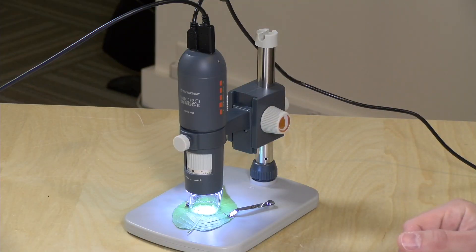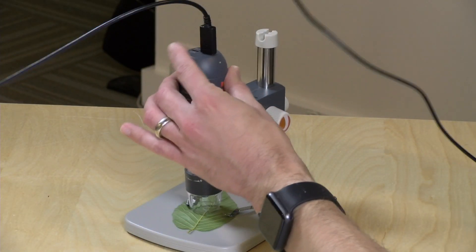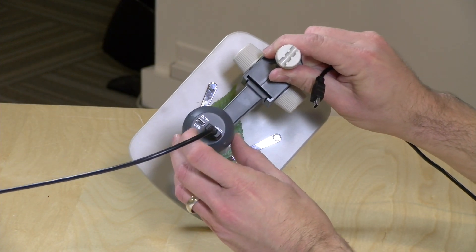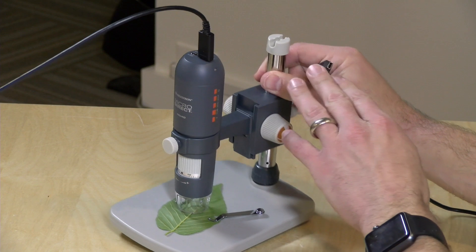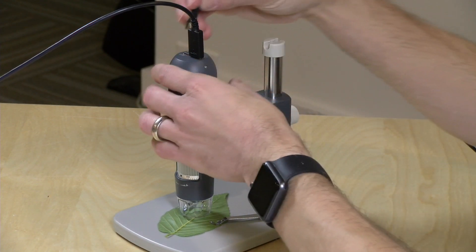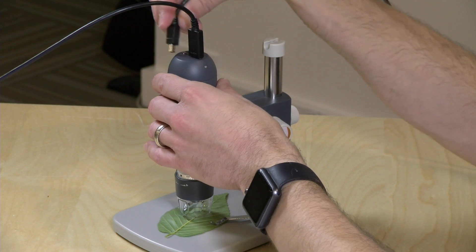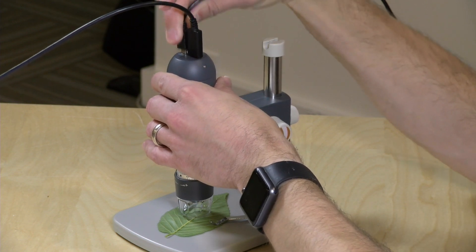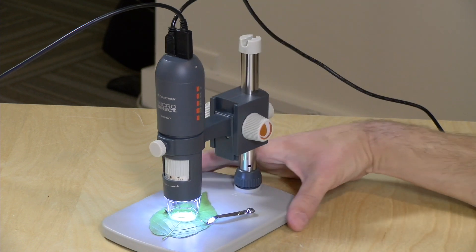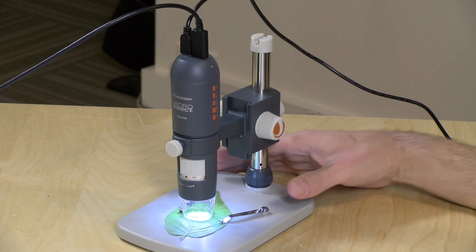Still kind of cool, as we just saw with the bug crawling around in there, to be able to see things that you may not be able to see with your eyes. Now the hardware is very simple to operate. It is USB powered. There's a USB port here at the top of the microscope — this is an older USB mini connector, but you do get the cable in the box. It goes out to a regular USB plug that can be used with any phone charger, or you can plug it directly into a computer. If it's plugged into a computer you can actually use it with some software, and I'll show you that a little later in the video.